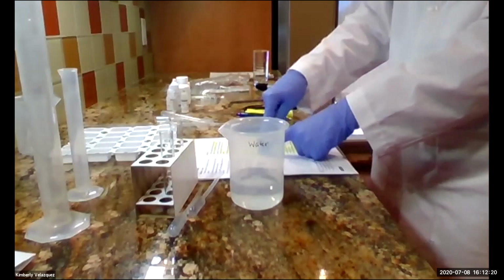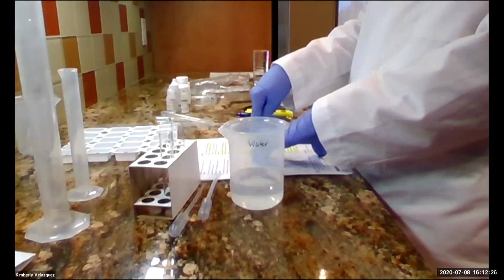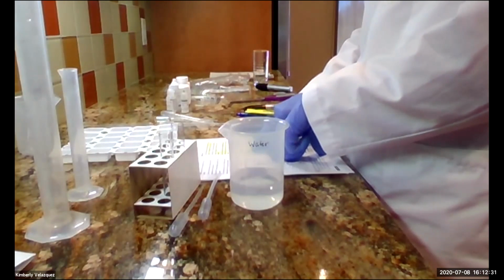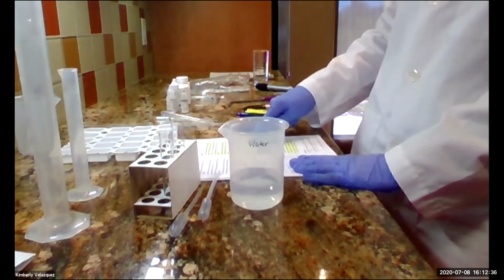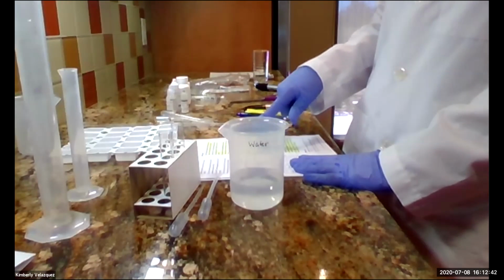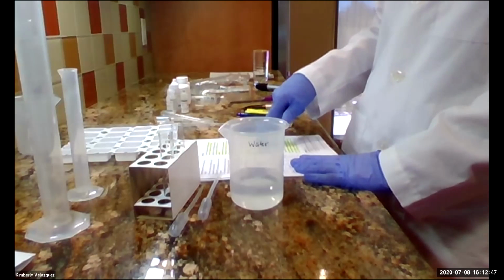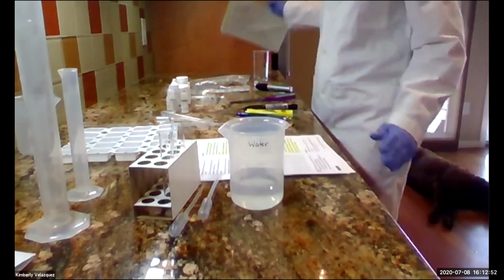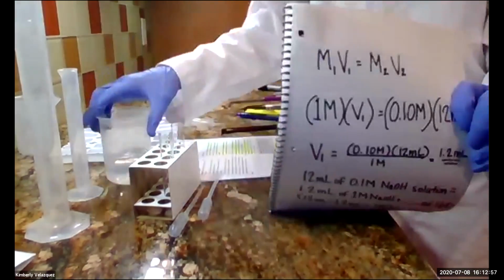Now comes the calculation part. Number 6 and number 7 ask you to calculate the volume of sodium hydroxide that you would need to prepare 12 milliliters of a 0.1 molar solution of sodium hydroxide. You're going to use the same steps as before. The only difference is now it's 12 milliliters total solution rather than the 10 milliliters that were in the example. Okay, so I've done this for you, and I'm going to just try to show it to you right now on camera.